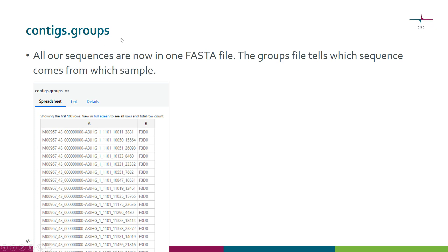Mothur also produces a groups file because now all your sequences from all the samples are in one FASTA file, but we still need to keep track of what sequence came from which sample.